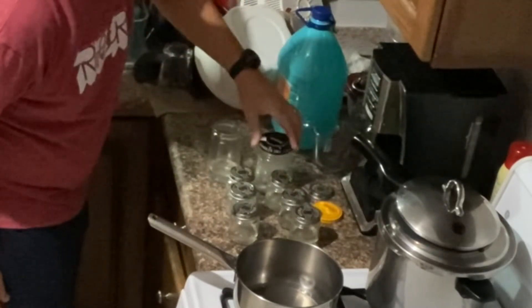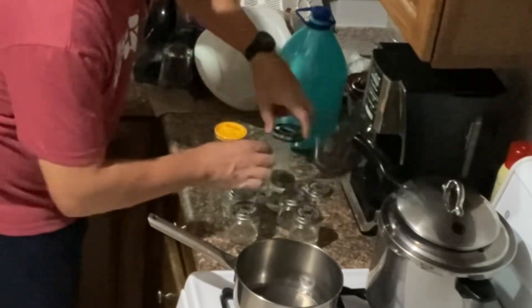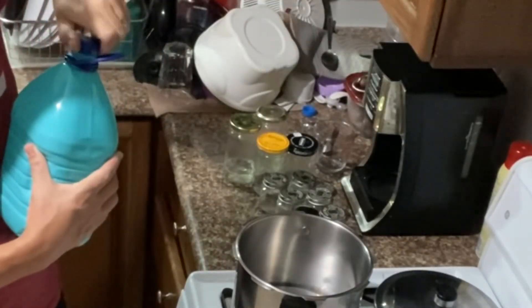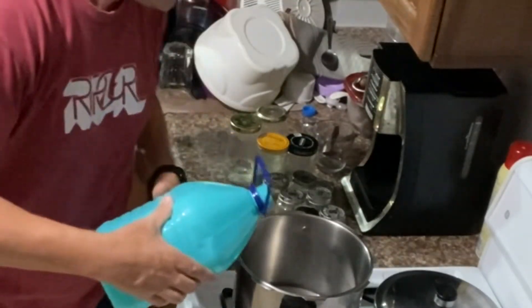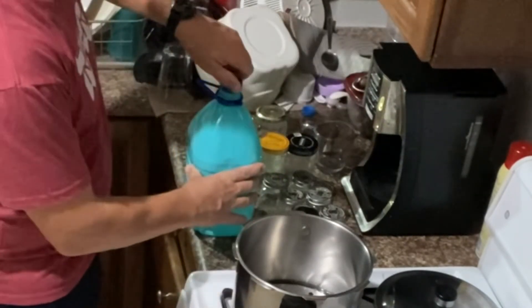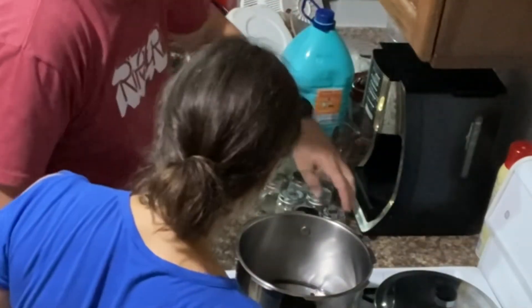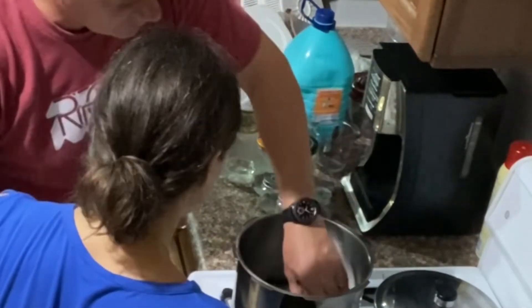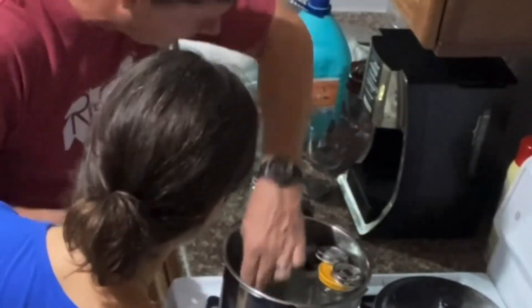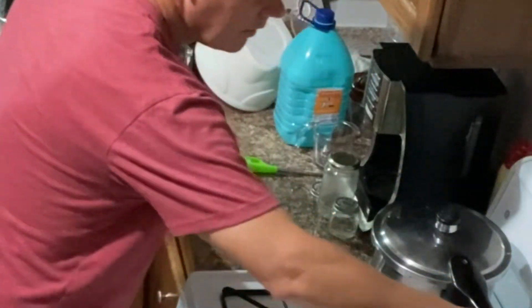After the lids are set in place, you take the mixture and put it in the pressure cooker and let it cook at high temperature for 40 minutes.